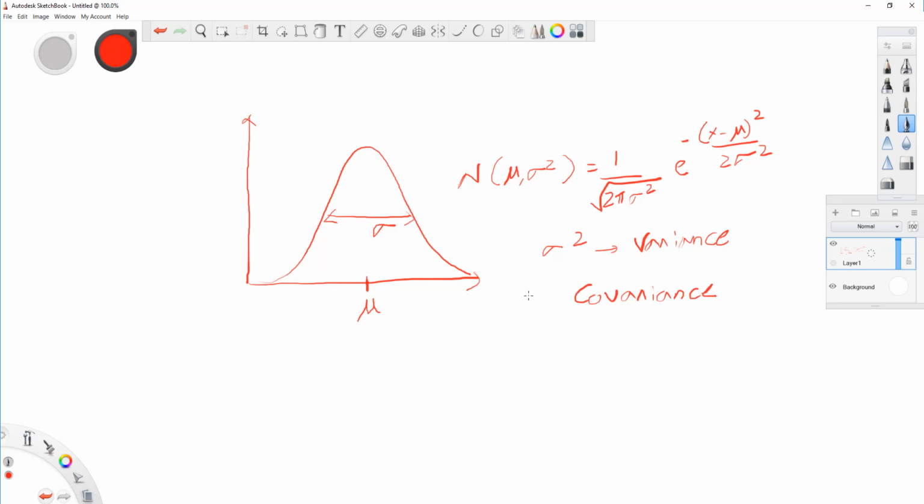So covariance, and why am I mentioning this? Because covariance is one of the inputs of our Gaussian mixture model. And again, implementation is very easy. I'm just giving you some background information. That's pretty much it. Okay, so now let's actually understand the Gaussian mixture model by taking a one-dimension example, with some data that I'm going to just draw on the screen right now.